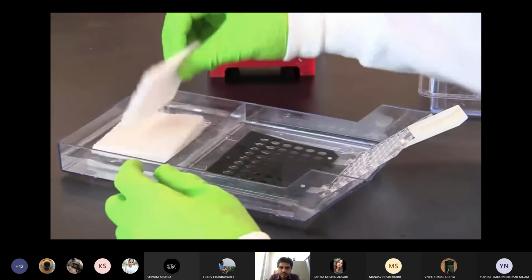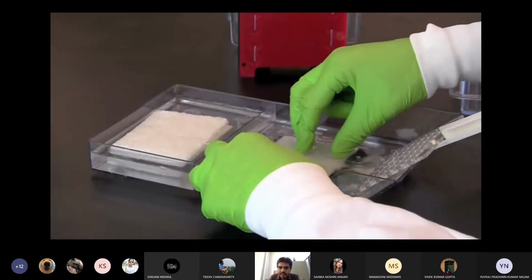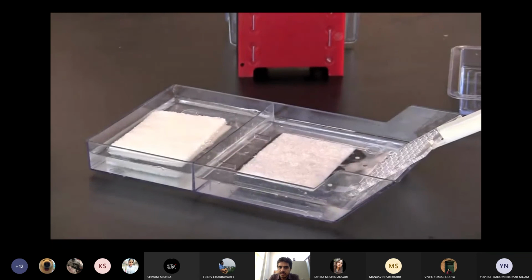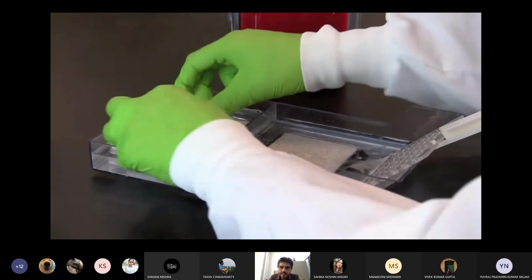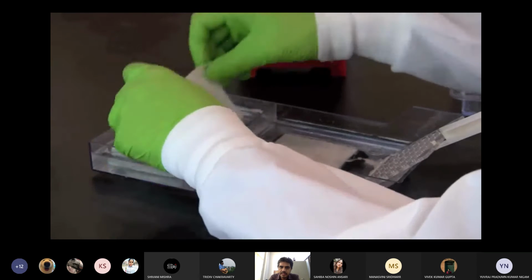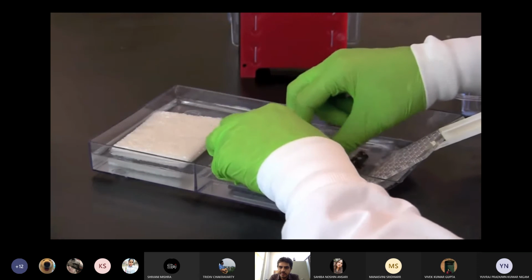Lay one fiber pad flat on the black plastic. So first you have to place your pad. We are doing it in water, so it will be a buffer, so that no bubbles will stay. Place a sheet of blotting paper on top of the pad. Be careful to avoid any bubbles between the pad and the paper. Make certain the blotting buffer covers the paper. This is a type of Whatman number 1 filter paper.